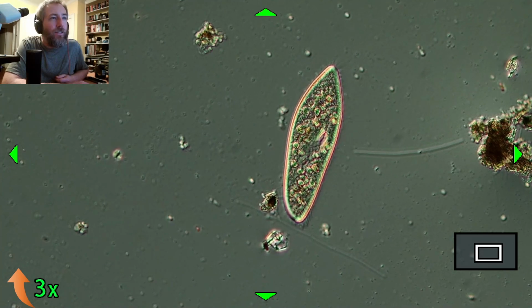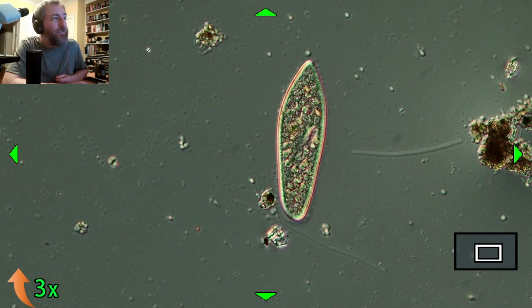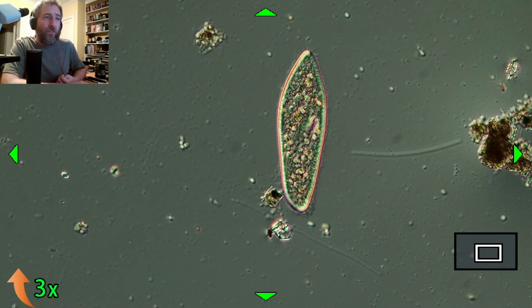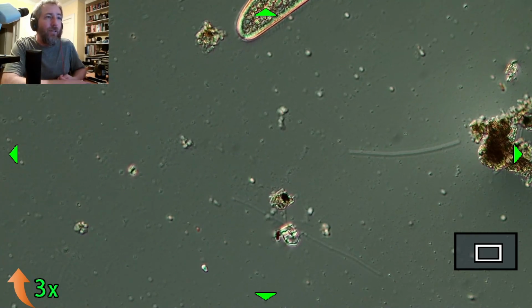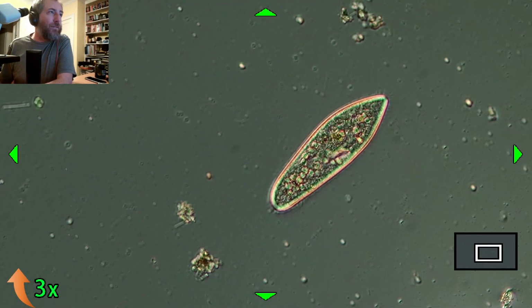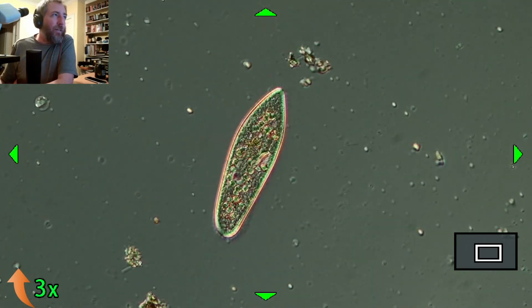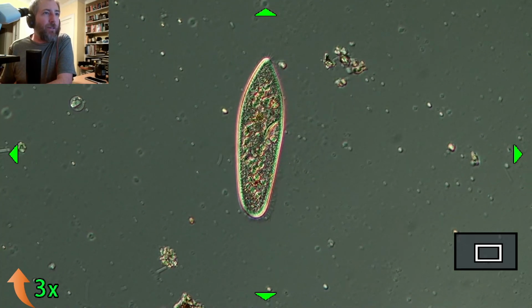What kind of creatures would eat those algae? Diatoms are eaten by basically everything. That's everything that will fit into the mouth. So, fish, snails, invertebrates like aquatic insect larvae, and even amoeba and other things that are found in these sorts of settings. So they are basically the base of the food web here because they're autotrophic. The larger organism, the Oscillatoria, probably could only be eaten by something like a fish, but they're probably not a preferential food for fish. But they might eat it if they were hungry, like the goldfish might scrape them away on the sides.